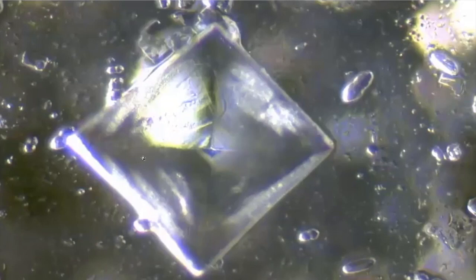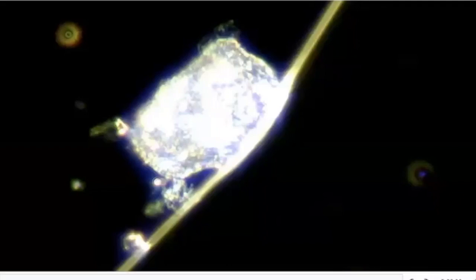And looking at MasterPeace under the microscope, for example, this is a large zeolite crystal, but with dark field microscopy, it refracts the light. We have a dark background and particles show up bright. Especially with zeolites, it's a very bright crystal under the microscope. So this is just one of the crystals caught next to an air bubble that's sort of propelling it along.